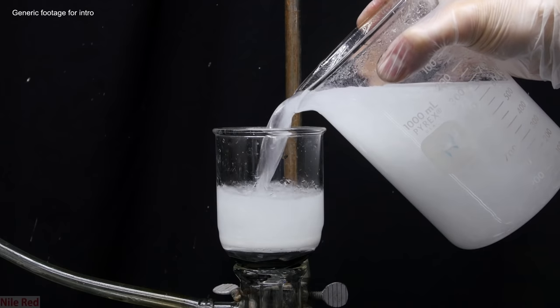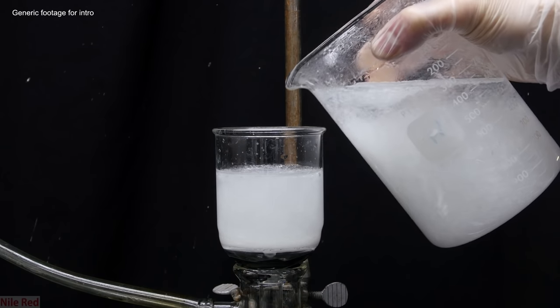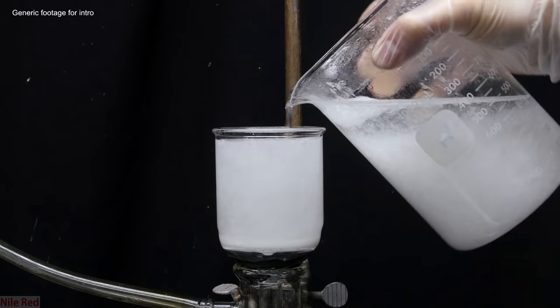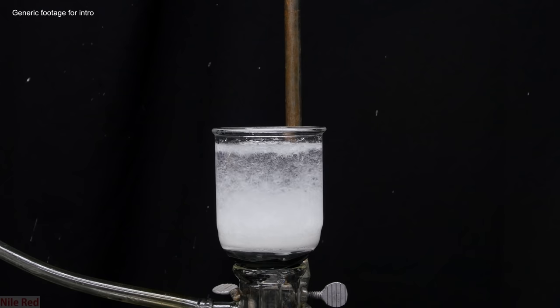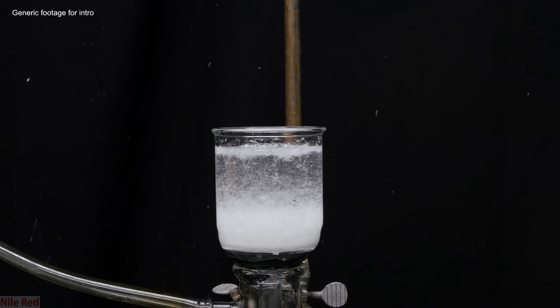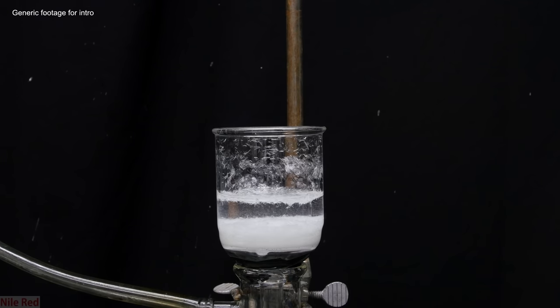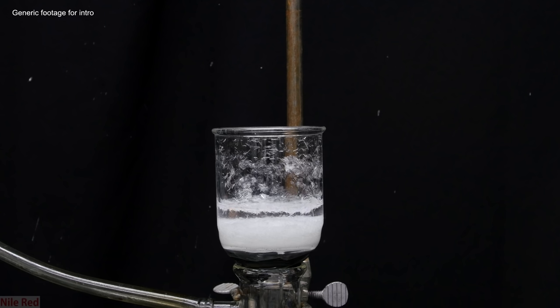The second method is a little harder, and this involves dissolving everything in solvent A, and slowly adding solvent B. Usually our compound of interest is insoluble in solvent B, so as more is added, the solubility of our compound of interest decreases in the solution. This, however, doesn't have the same effect on the impurity, which will just remain dissolved regardless.